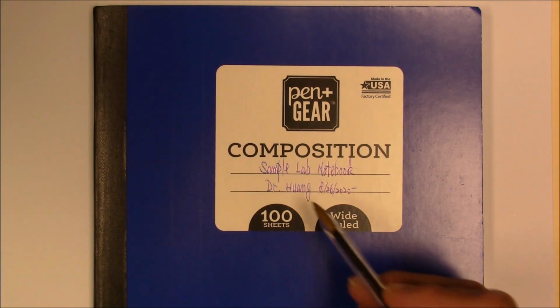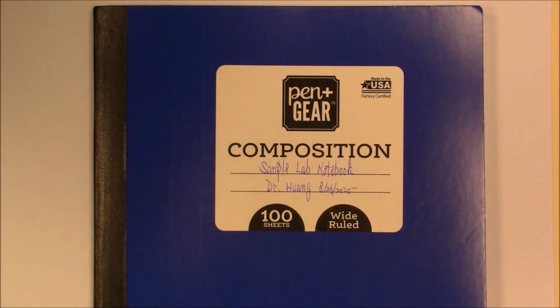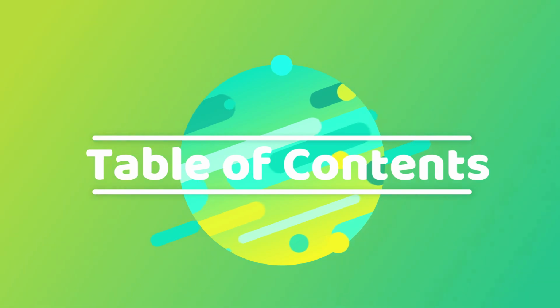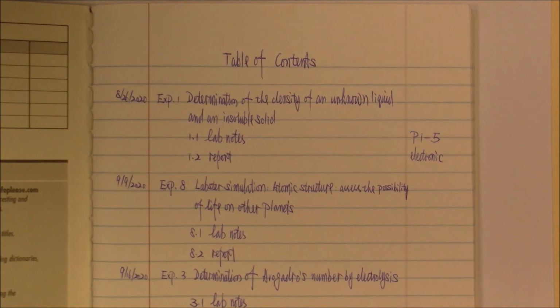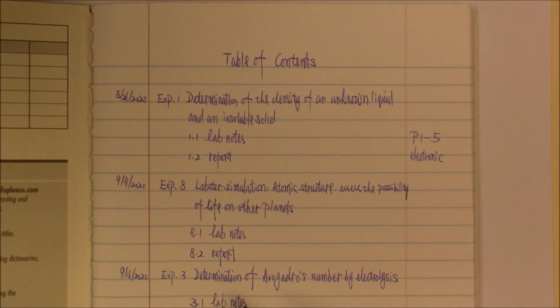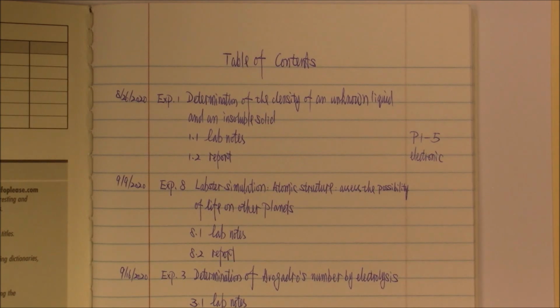Now let me open this lab notebook and see what is inside of a typical lab notebook. Just like regular books, the first few pages are the table of contents pages. The purpose of the table of contents pages is to help the readers quickly locate what they are looking for. There are 3 columns for the table of contents pages.